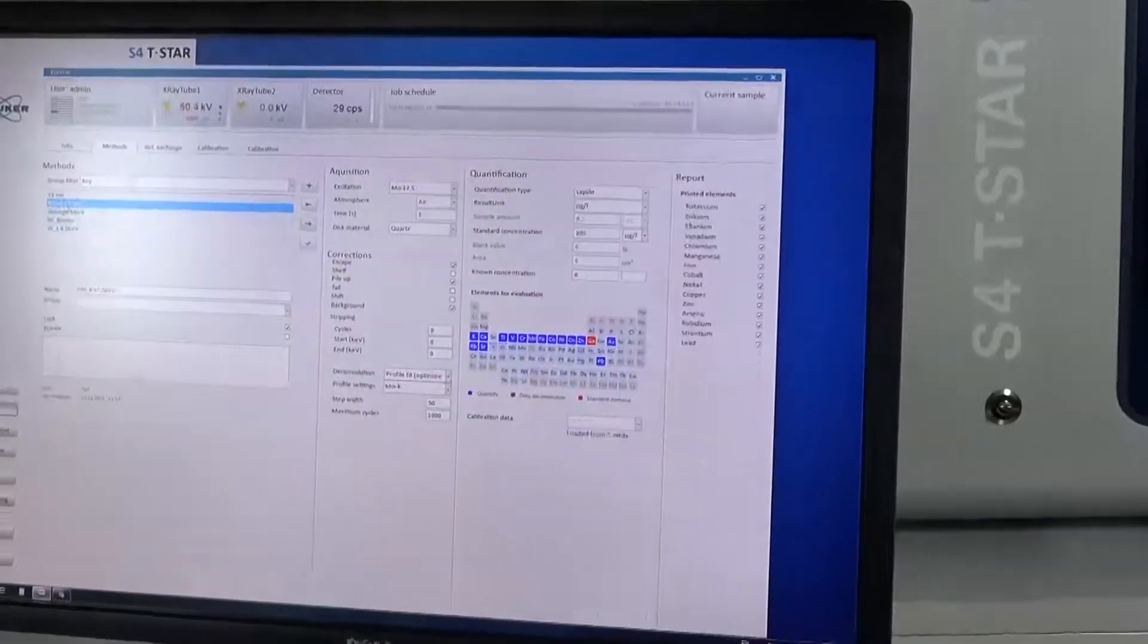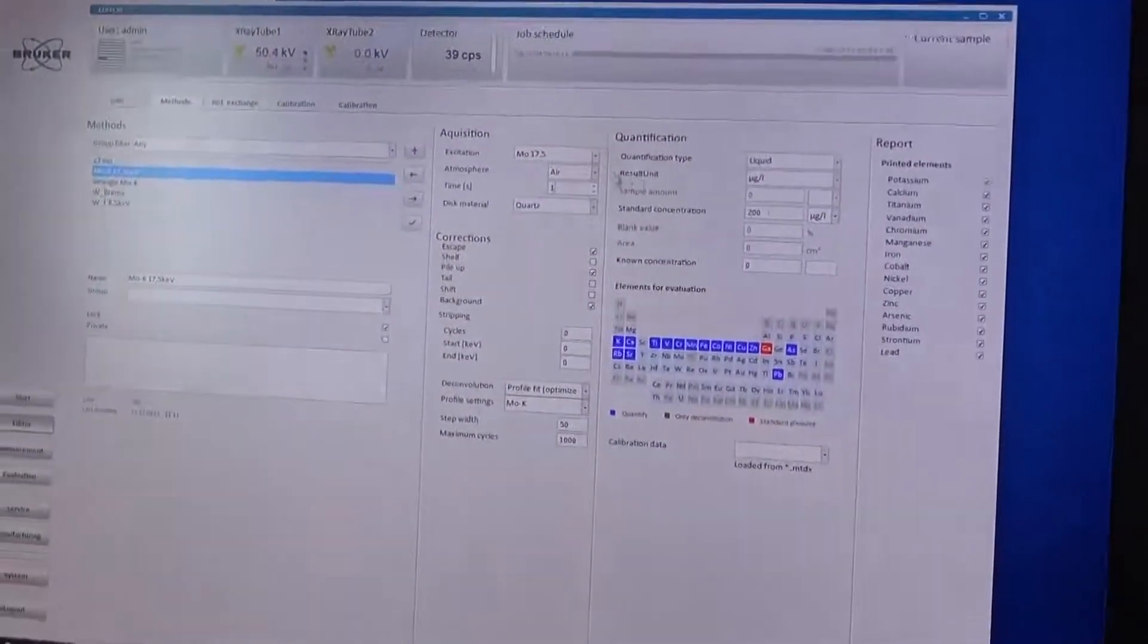The operator defines a job for the automatic measurement and quantification of the samples.